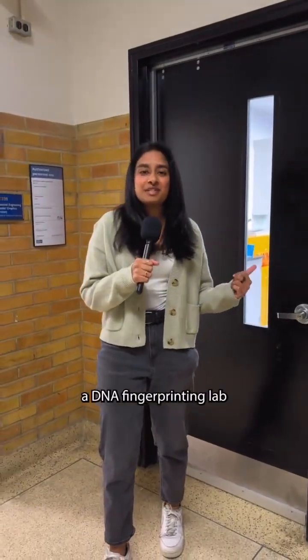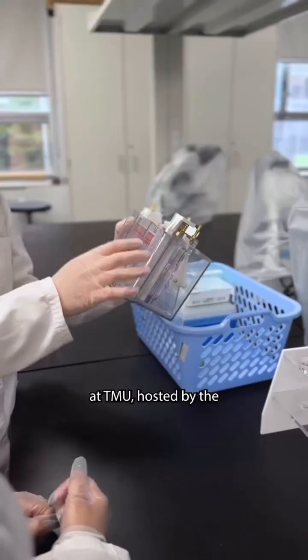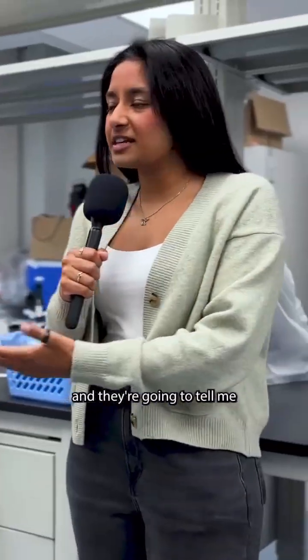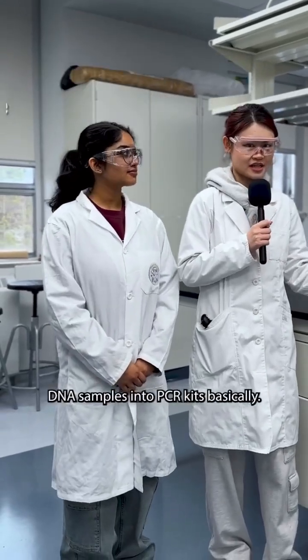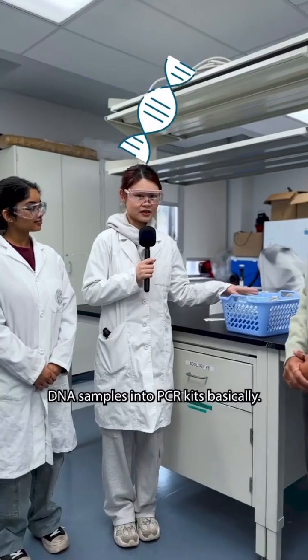Hey, my name is Ria and come along with me to a DNA fingerprinting lab at TMU hosted by the Ontario Science Centre. I'm here with Zia and Chandrima and they're going to tell me a little bit about what we're doing today. We're working with high school students and they're going to be loading DNA samples into PCR kits.